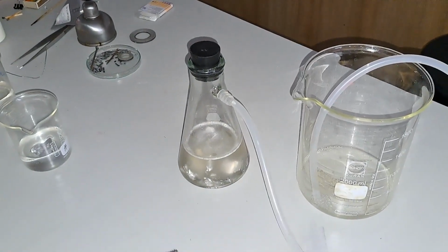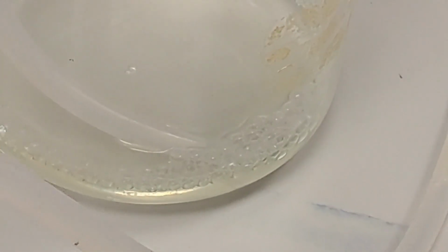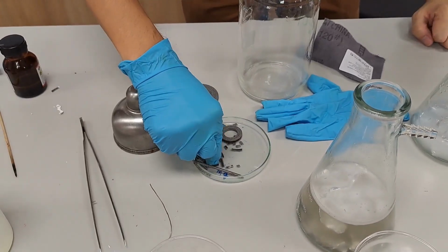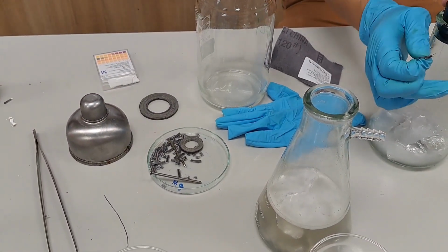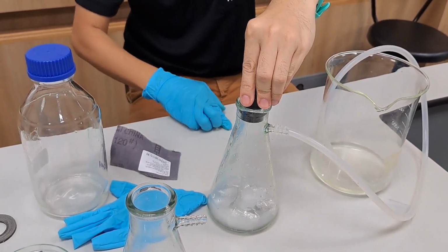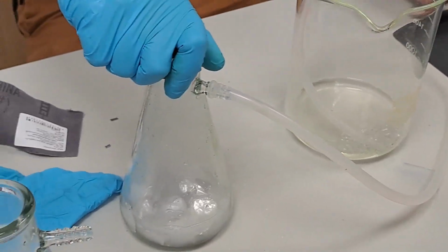Imagine the maid locking the door for you guys in the whole room. See the bubbles forming in there. Right now, let's add a bunch of magnesium. Is this the one that you rub already? Hydrogen gas. Now light it. There's some fire, water in it.